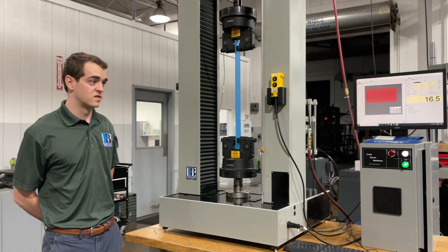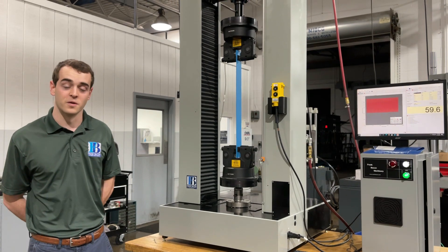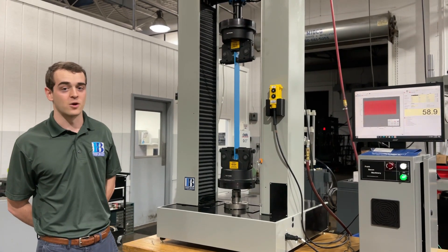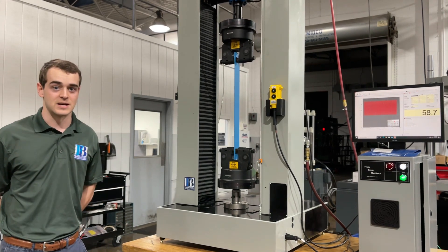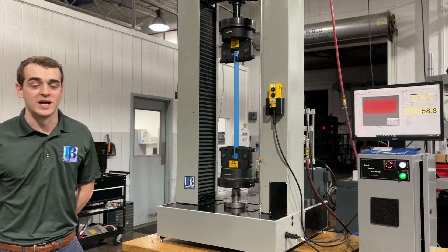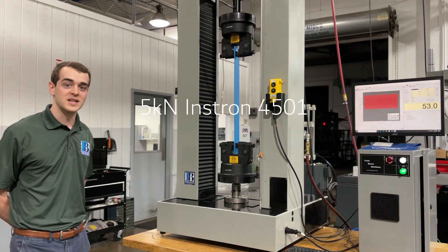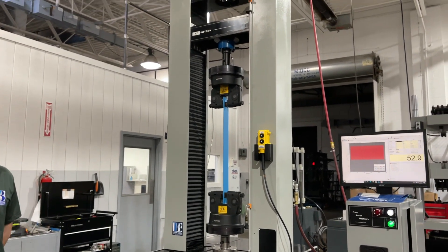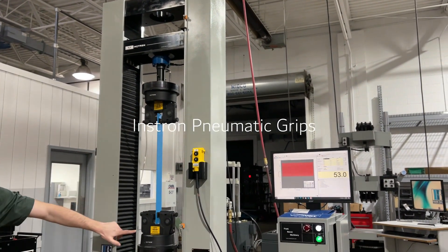We knew we needed a machine that was not a typical tensile tester, although the spec does call for a tensile testing system. There are not a whole lot of machines that can do that specific testing. We knew what we had in stock was going to be the 4501 Instron — a 5 kN machine — that we fit with some really nice Instron pneumatic grips.